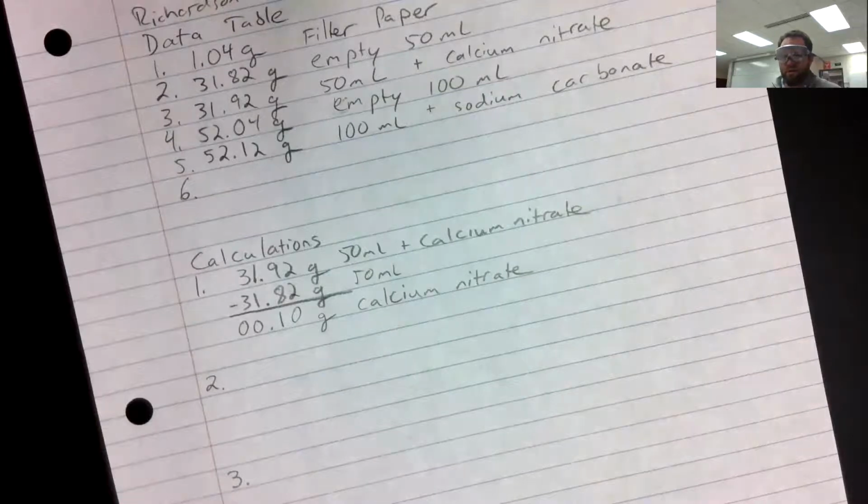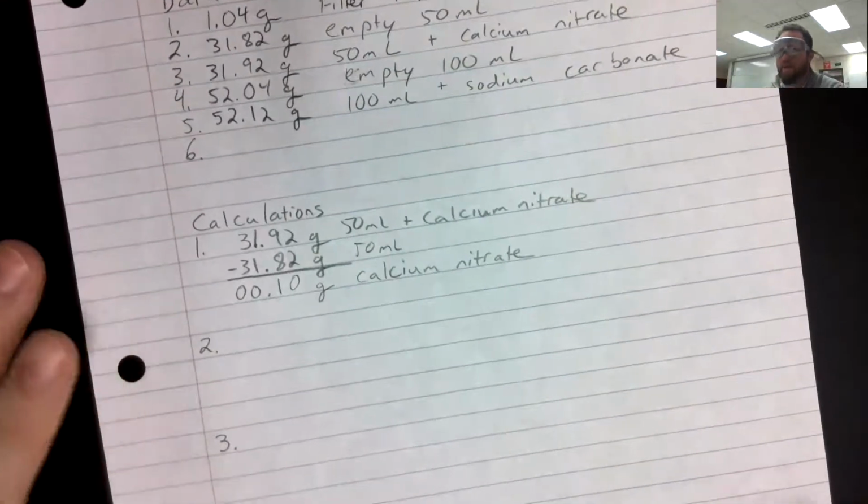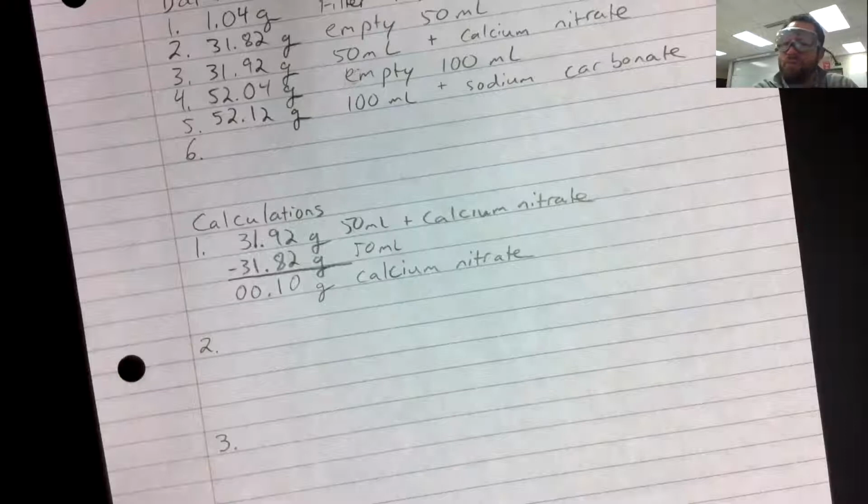And then this is big. I know a lot of you guys don't like using your states of matter. Guys, you have to use those solubility rules on the back of your periodic table. You have to solve for your states of matter. And here's why. You guys remember when we combined the solutions, and they turned a white powdery colored material there.